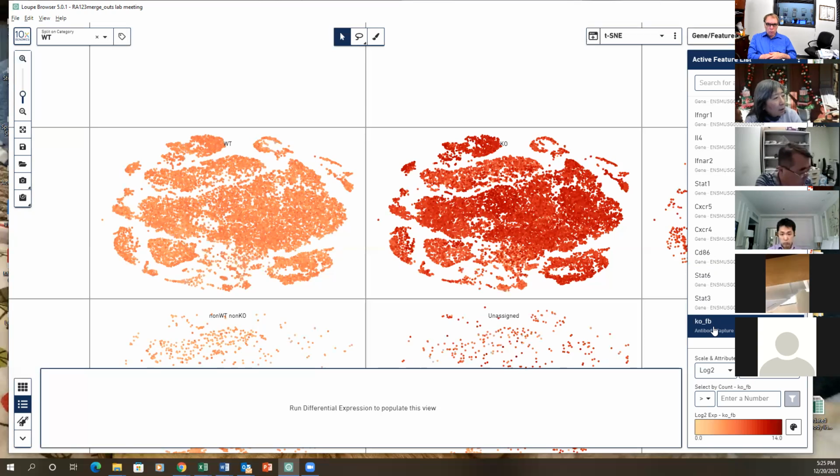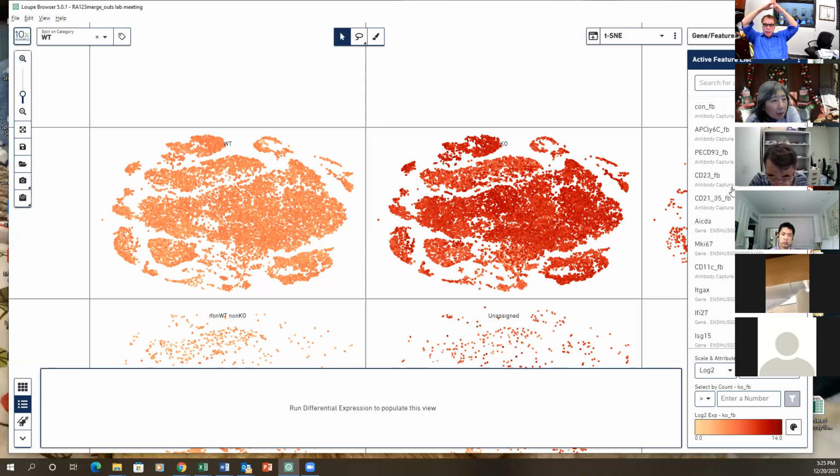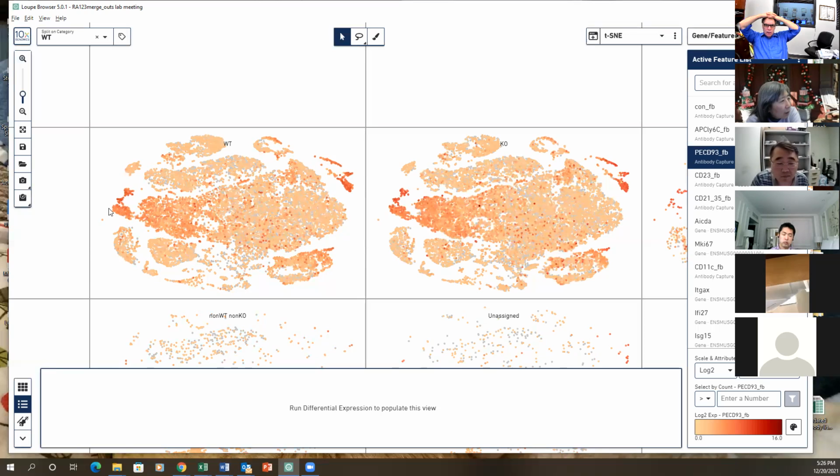Yeah, looks similar. So I think we need to do quite a lot of analysis. Otherwise, just like that, it's hard to say anything. Nothing really stands out very well. And you look at the populations in each one, like your little thing that it decides. I can see what it is. So 93, transitional, is on this end.